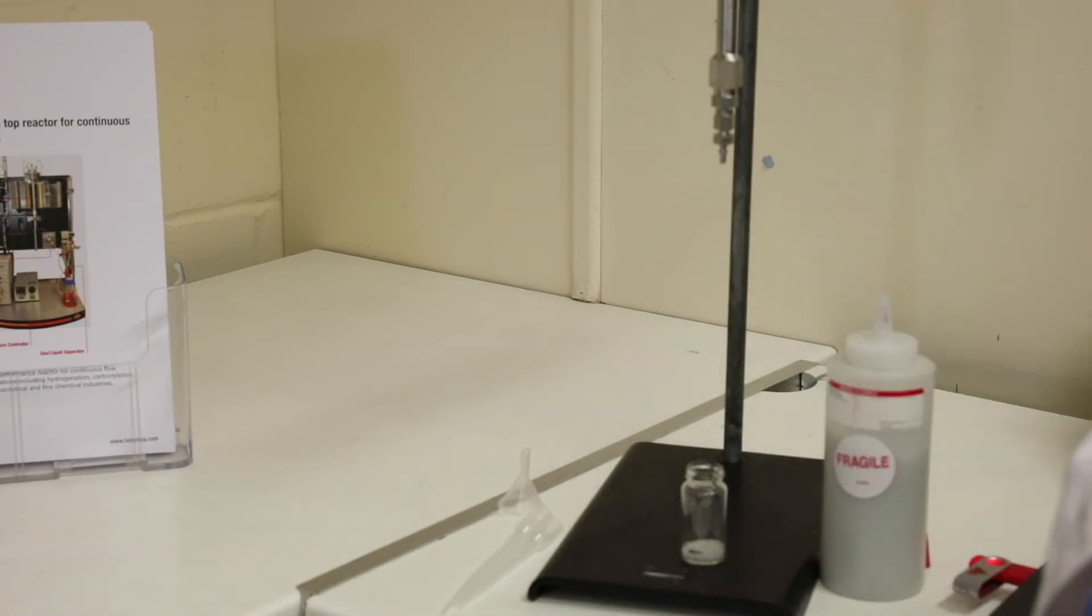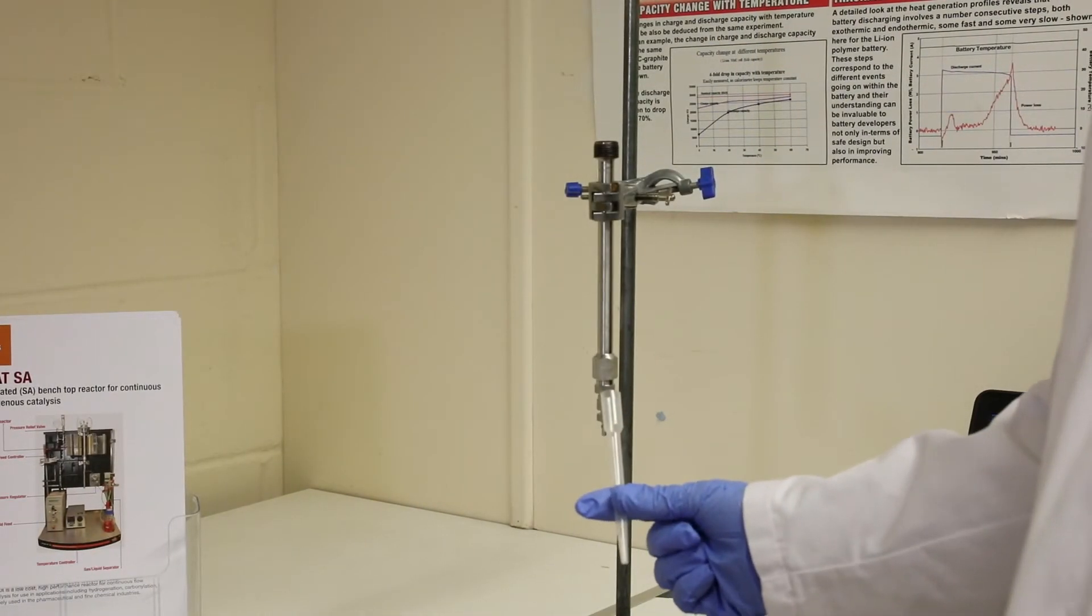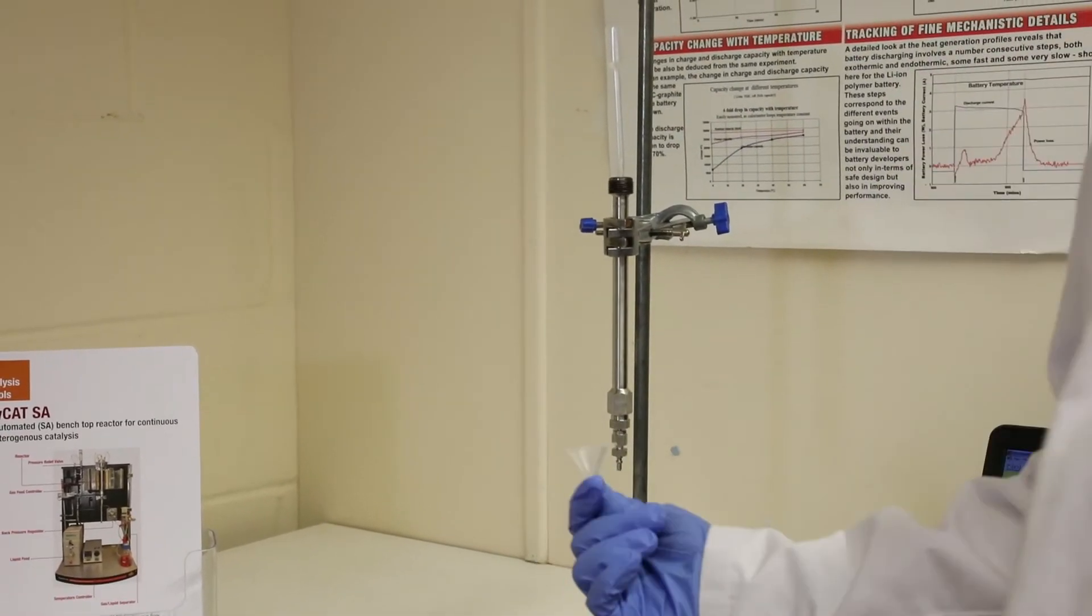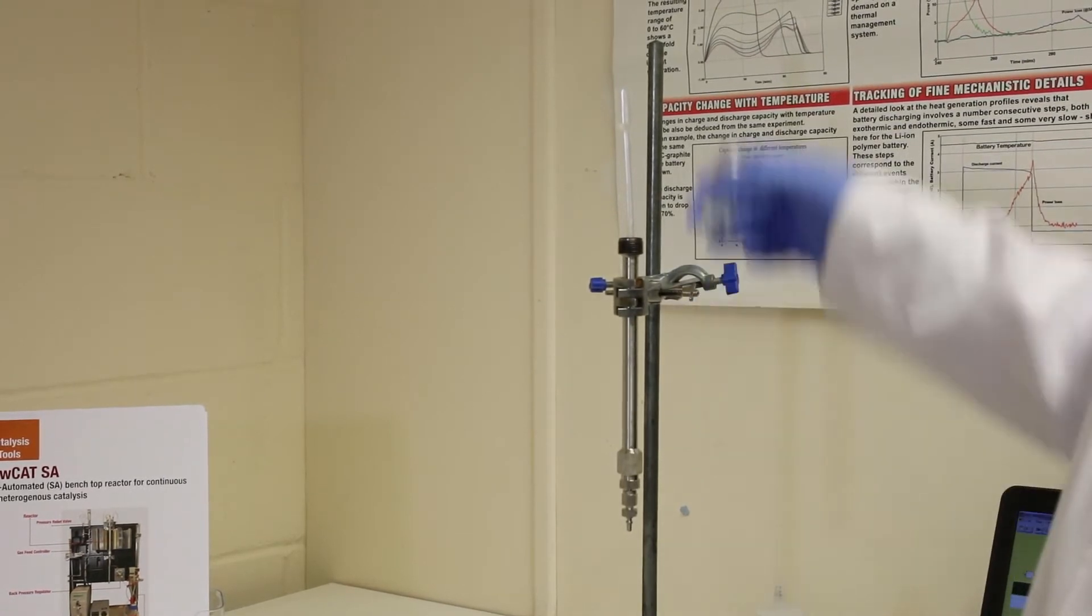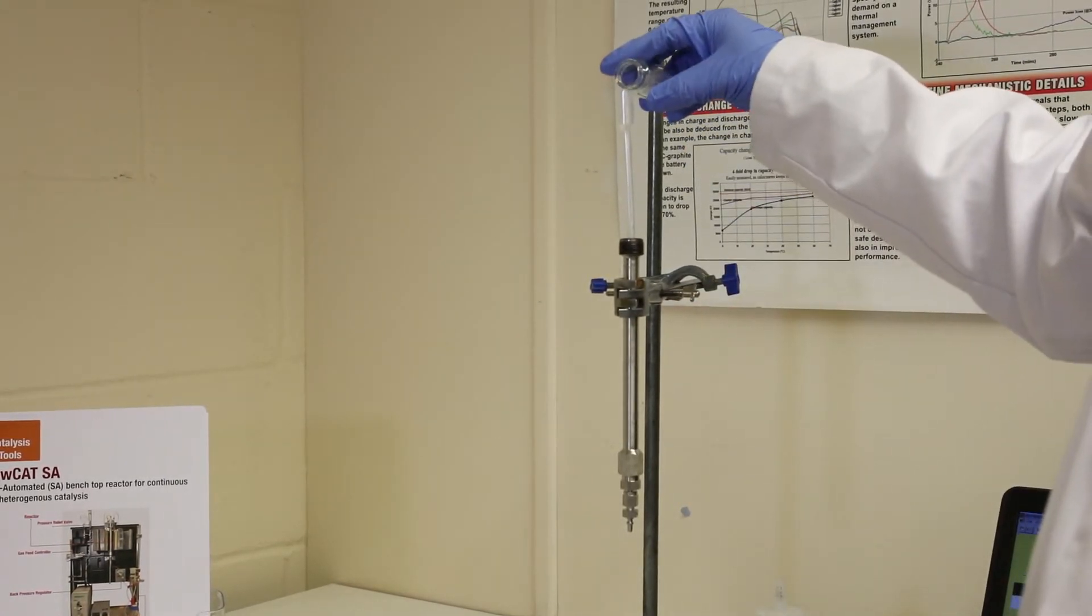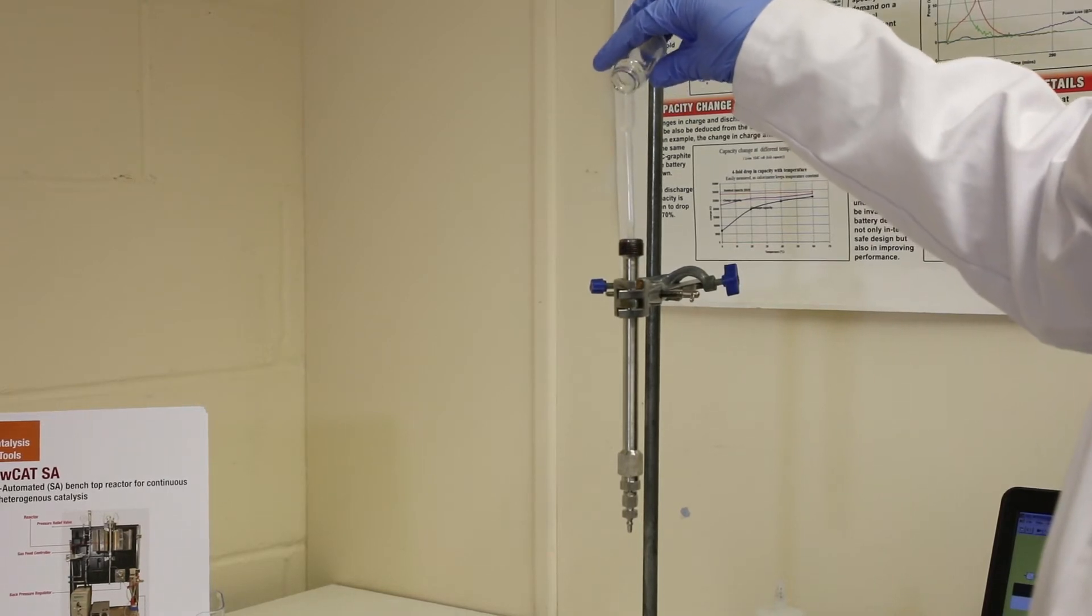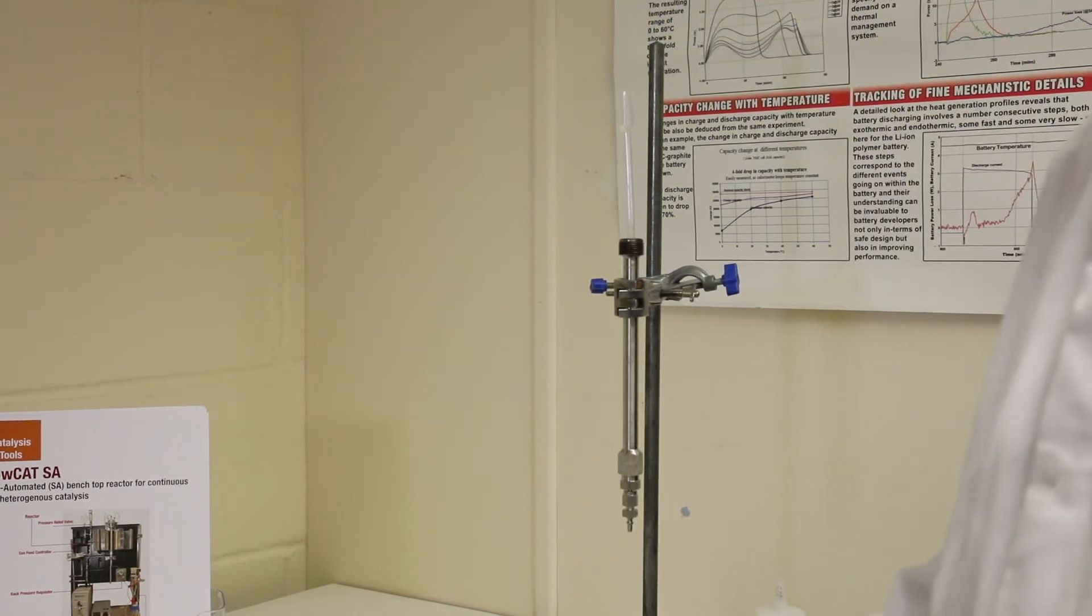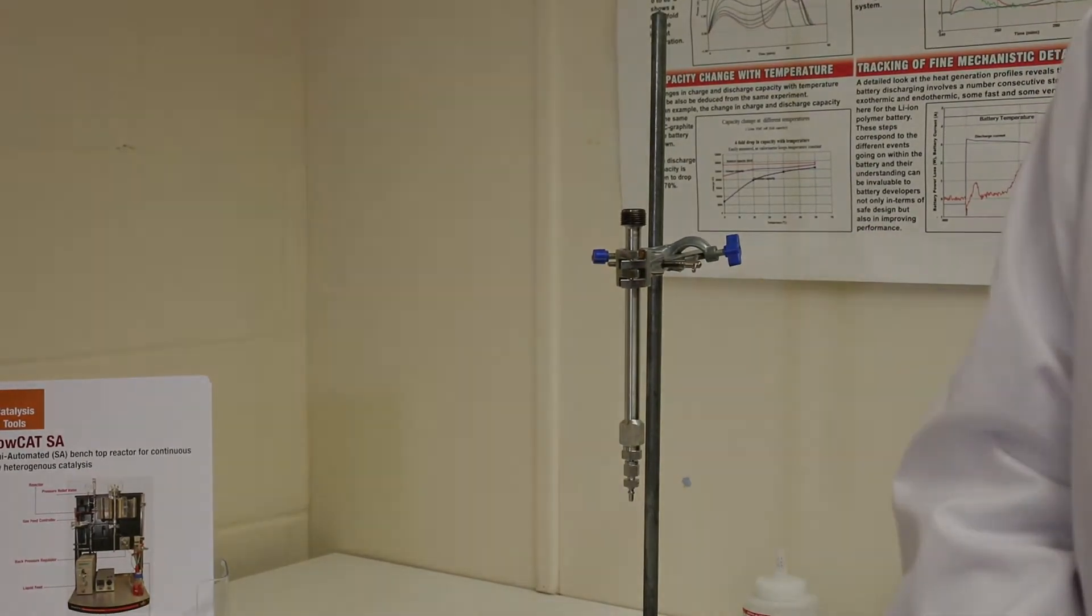Next we want to load it into the reactor. For this, we use a funnel. In this case, I've just trimmed down a plastic pipette because it fits nicely. You can buy small funnels such as this one here. Just have our vial here. If we've mixed that around nicely, we then just literally pour it down the funnel into the reactor. Once that's gone in, we just give it a little tap to level it off, take the funnel out and that's our reactor packed.